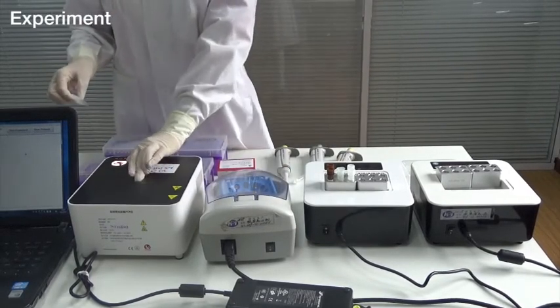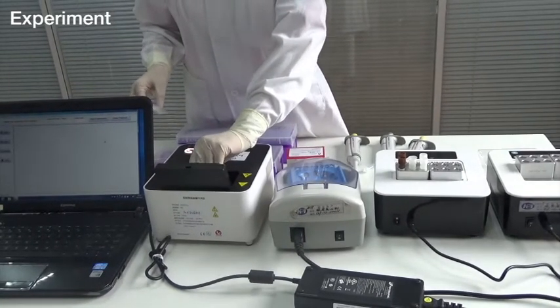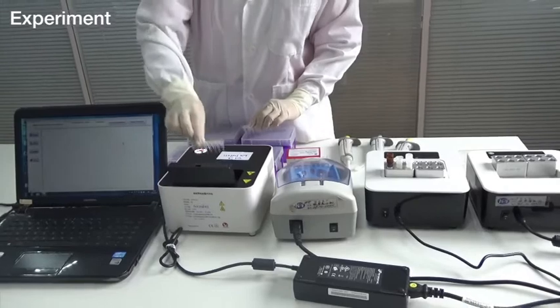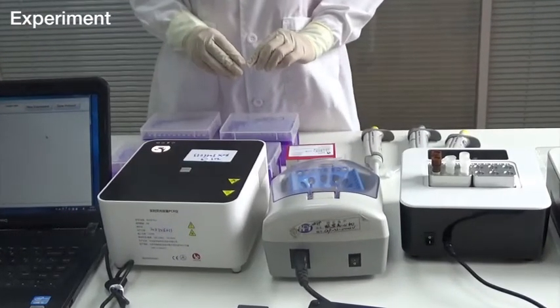The fourth steps: experiments. First, put the sample tubes into the PCR machine, remembering the order of the different sample tubes.